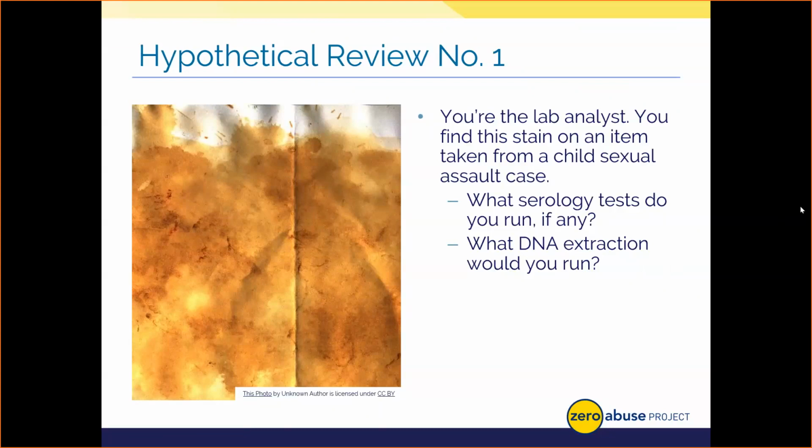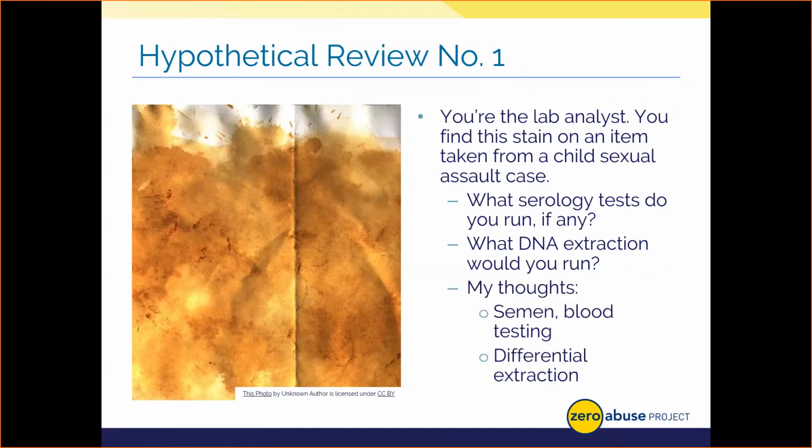I think those are good examples, especially from the serological standpoint. I know I'm asking you a lot with the DNA extraction, right? Just for the sake of time, we'll go ahead and look at my thoughts on this. The stain's that yellowish or brownish color. I'm assuming, based on my visual observation, that it looks like there might be some red specks in there too. Maybe the sexual assault resulted in physical damage and we have blood and semen deposited. So serologically speaking, I would definitely run with the phenolphthalein and heme direct to confirm.